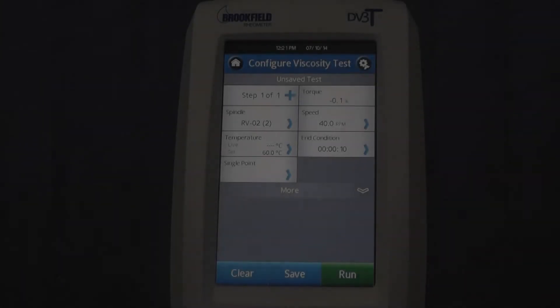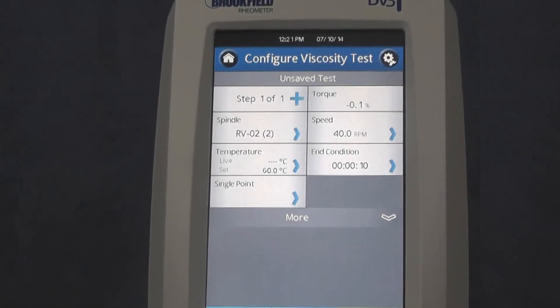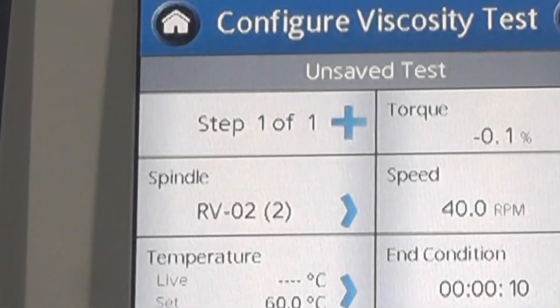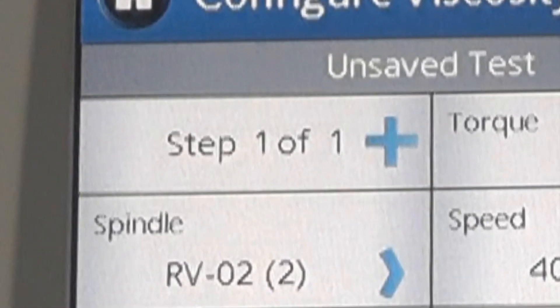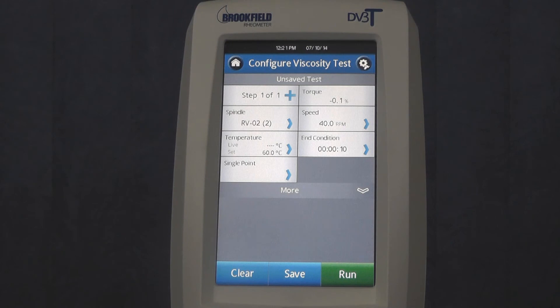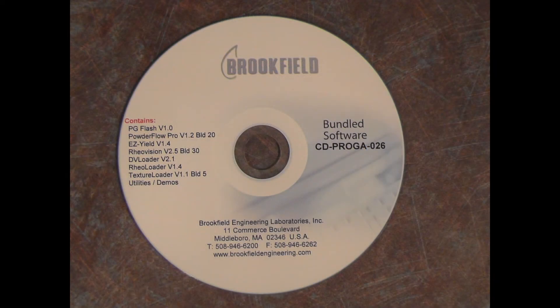The second way to change the speed during a test is to set up a multi-step program. The DV3T can create multi-step programs directly from the instrument, while the DV2T would need to use the free software PG Flash.